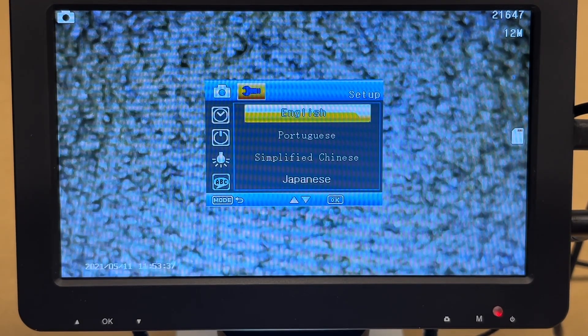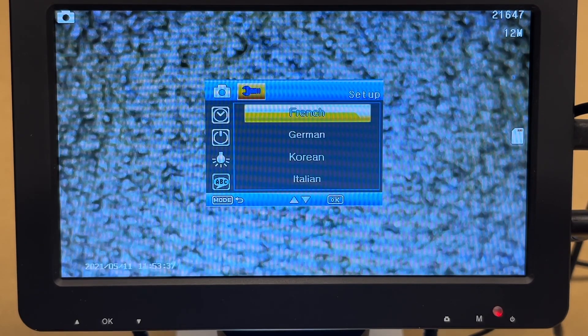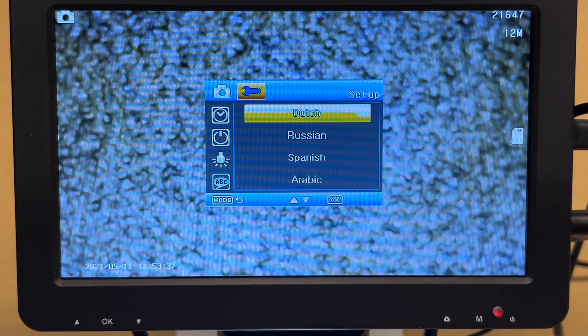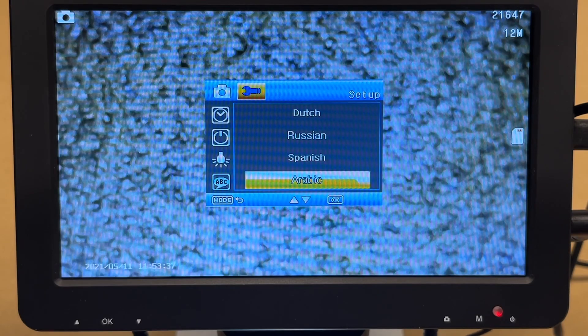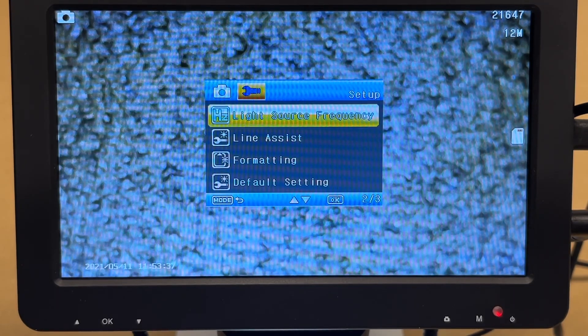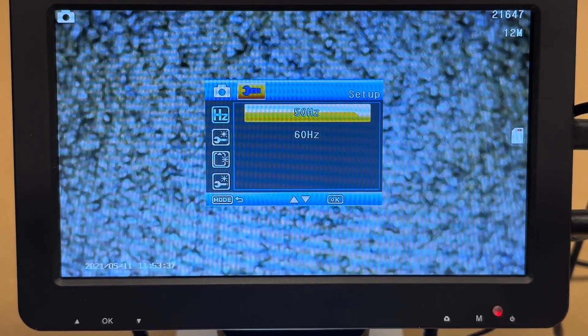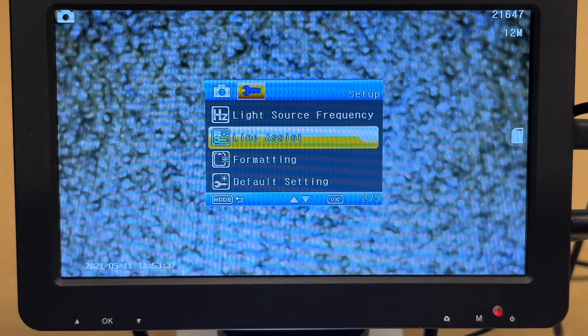English, Portuguese, simplified Chinese, Japanese, French, German, Korean, Italian, Dutch, Russian, Spanish, Arabic. So lots of language options there. Light source frequency: 50 or 60 hertz. So I'm in the US, we have 60 hertz. So I'll change that.